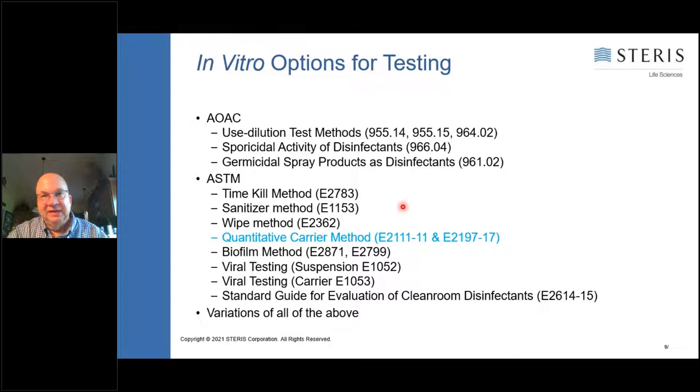One of those, and if you're interested, I can provide the links after the webinar. One of those is a recent 483 issued by the FDA to Emergent Biosciences. Emergent is the company that's doing work with the J&J vaccine. And regulators went in there and they had several audit findings directly related to ineffective cleaning and disinfection of the rooms and areas where they actually saw contamination from bags in the rooms. So FDA is looking at these things.